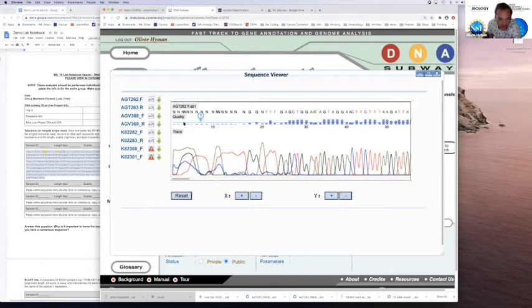So basically, this blue line here represents what's called a Phred score of 20. That's P-H-R-E-D, Phred score of 20. All the Phred score is, without getting into the gory details of it, is an indication of how high quality each individual base call is. When I say a base call, what I'm saying is this letter that you have in your sequence.